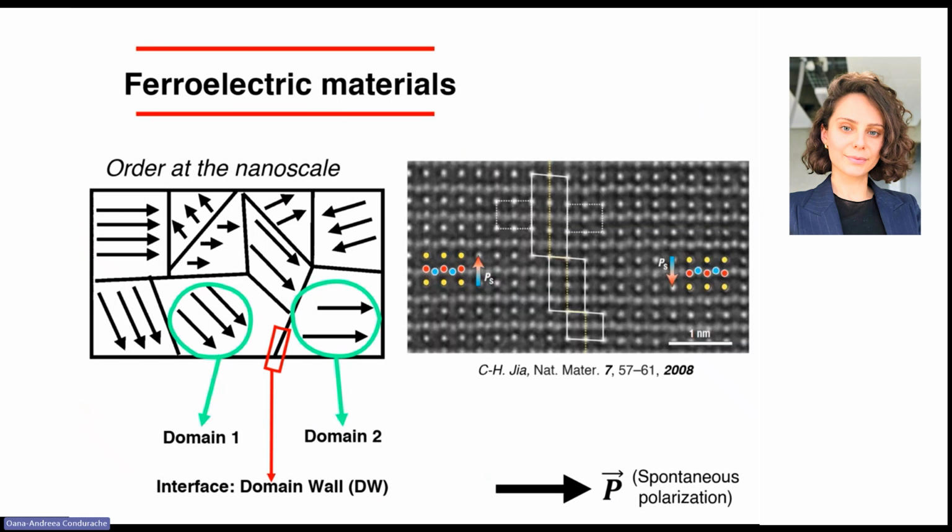Domain walls are very small features. They can only be a few unit cells wide. However, you will see we are very interested in domain walls because it's where the order breaks.